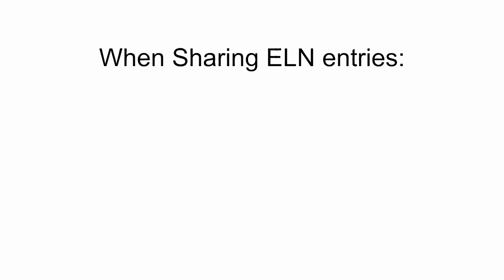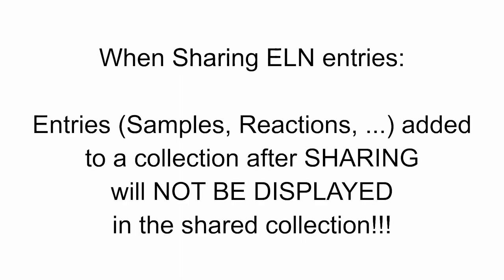Alterations of the shared data will be transmitted as well. However, items which are added after the content has been shared will not be passed on.